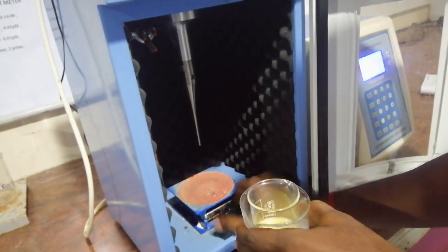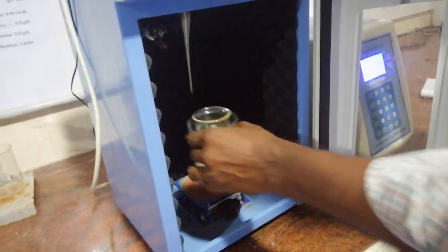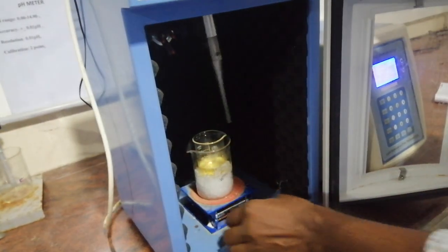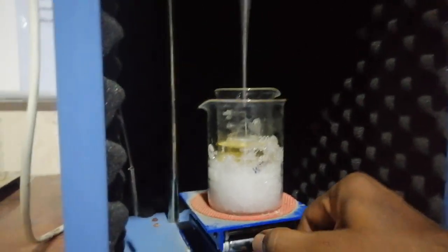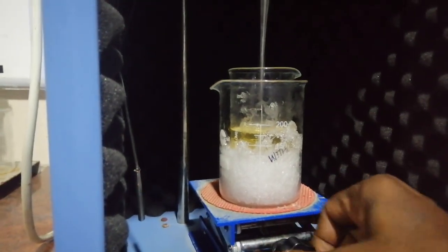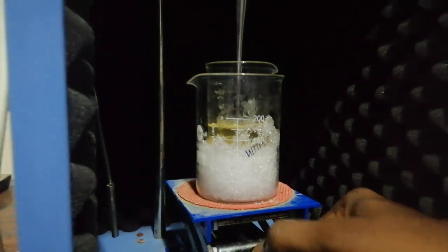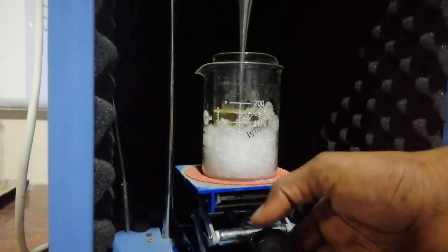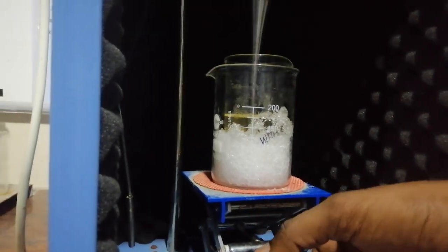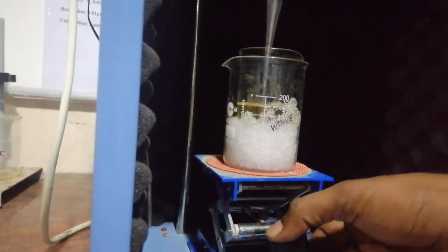So this is a movable tray. First, keep this tray at the bottom. This is the platform, and then adjust the level of the platform, so that your ultrasonic probe will be immersed in your sample. But you must ensure that the probe is not touching the bottom or the side wall of the sample container.